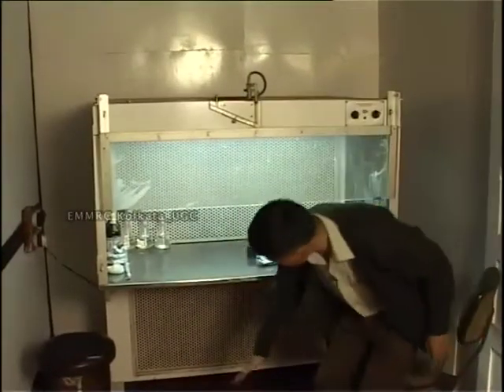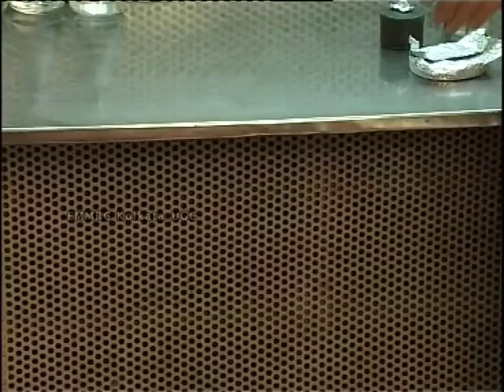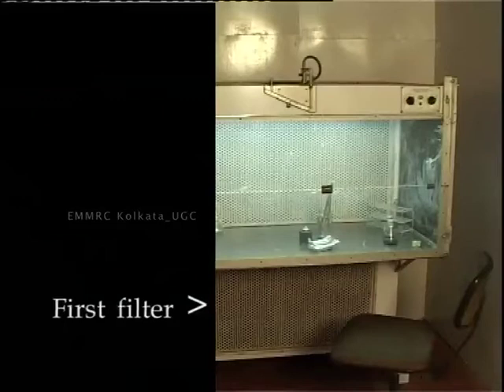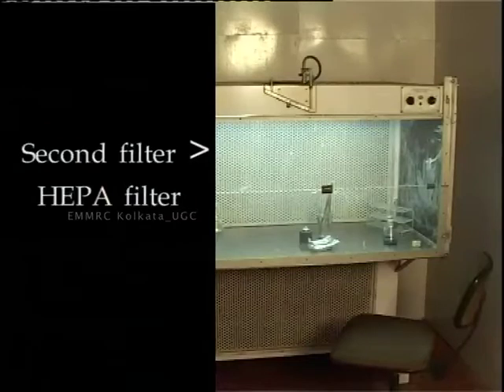But in Western countries, I've seen they never use ultraviolet light. They only use the airflow, the pure air which comes out whenever a person starts using it. So the air goes from here. This is the coarse filter, we call it. From here, the filter will filter out all the dust particles and all the big dusty ones. Then it comes up here. This is called the HEPA filter inside here.